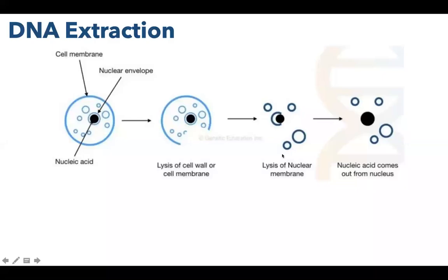Let's talk about DNA extraction or DNA purification. The general steps are the same as protein purification. The only difference is we must consider that your DNA is inside the nucleus. Furthermore, if you are considering eukaryotic DNA, then you also must think of a way to remove the histones on which your DNA is wrapped around if we want to obtain pure DNA samples.